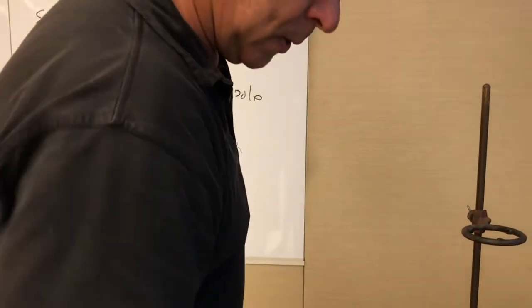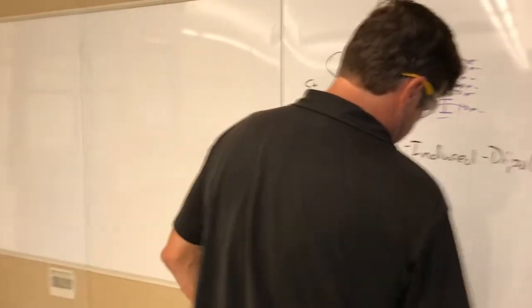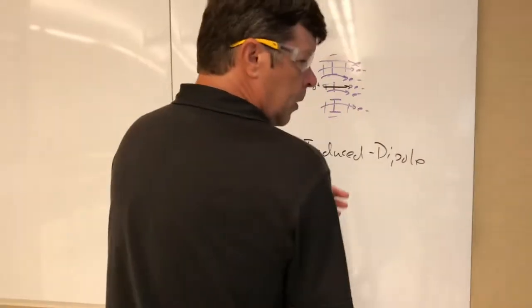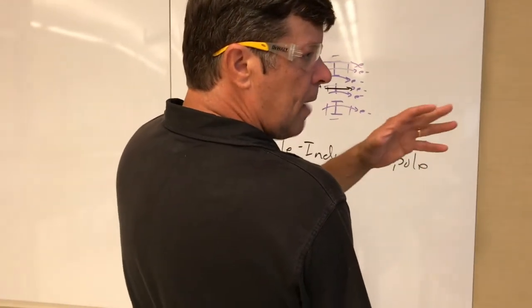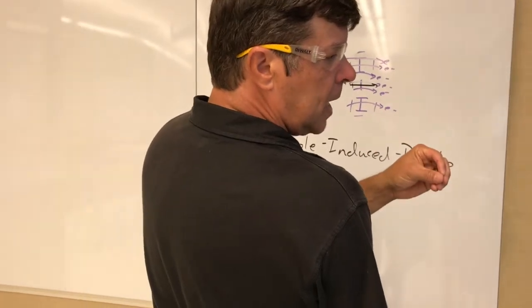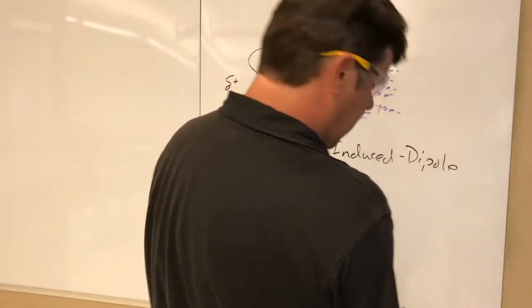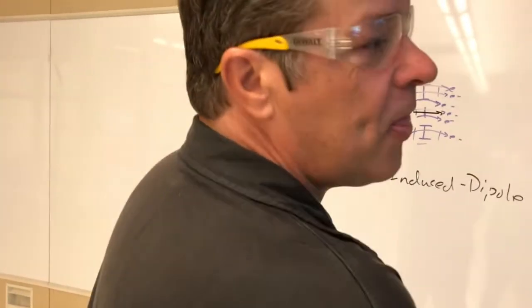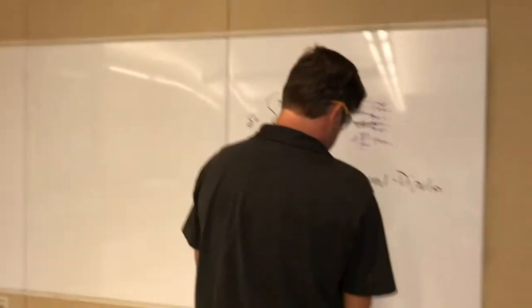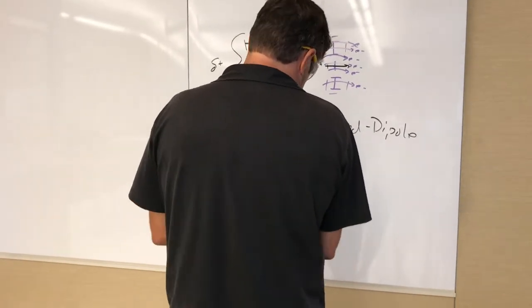And now what I'm going to do is behind my back, I'm going to shake this up, shake and vent it, so everything has a chance to knock into everything else. So the iodine's knocking into the cyclohexane, water molecules are knocking into water molecules, knocking into iodine. So why don't you pause this video and think about what this is going to look like. And I'm going to continue, hopefully you can't see this, I'm going to continue shaking and venting.